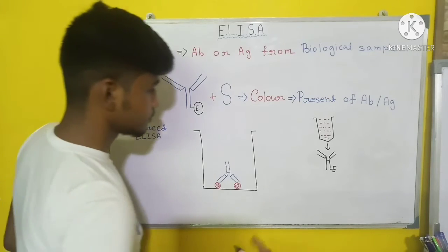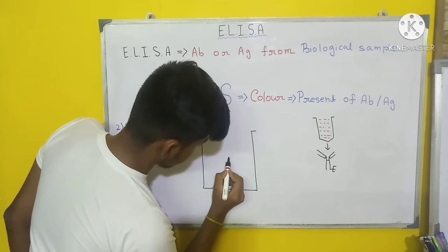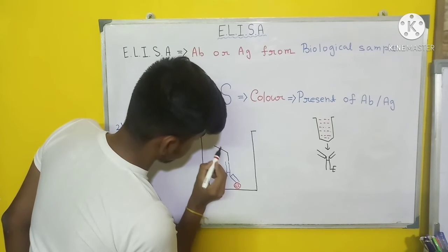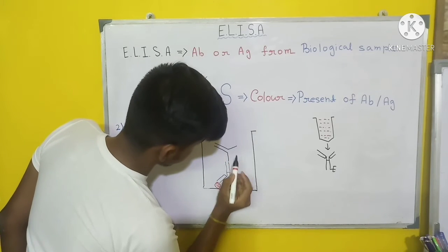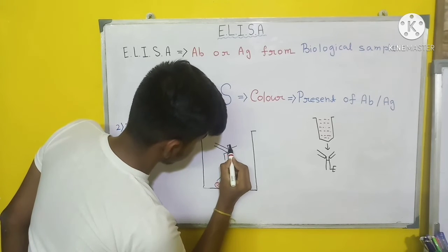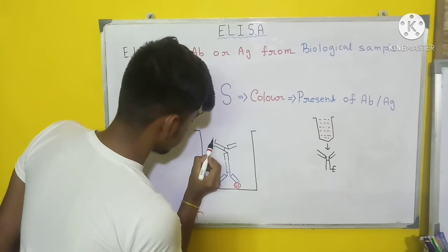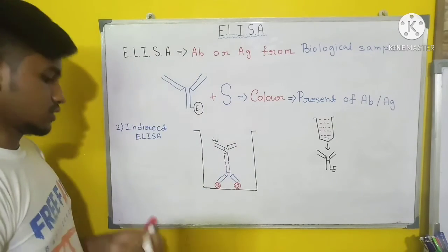So now the enzyme linked antibody is attached.